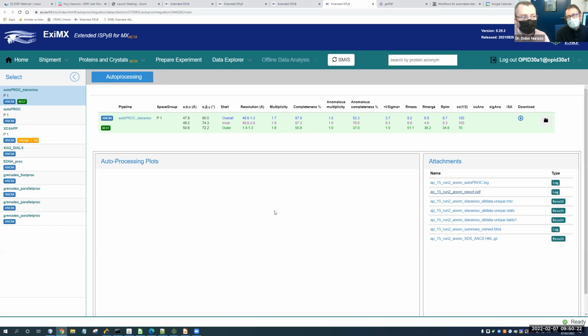What we see is that there's an extremely good correlation over all of the samples we've ever processed between predicted and achieved resolution, but it's very slightly below. So Edna does very slightly tend to underestimate the final resolution that you can get, but it can't be perfect all the time either. Okay, thank you.